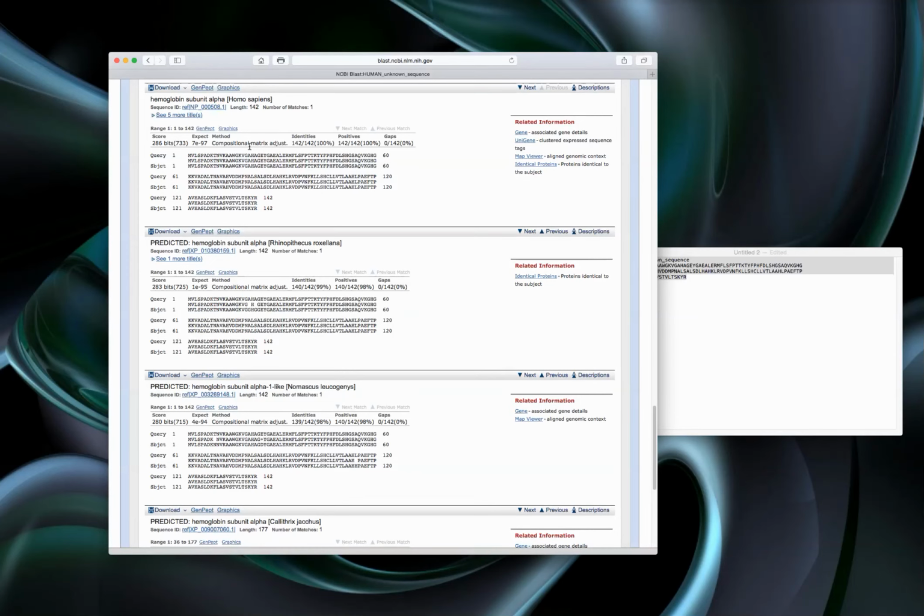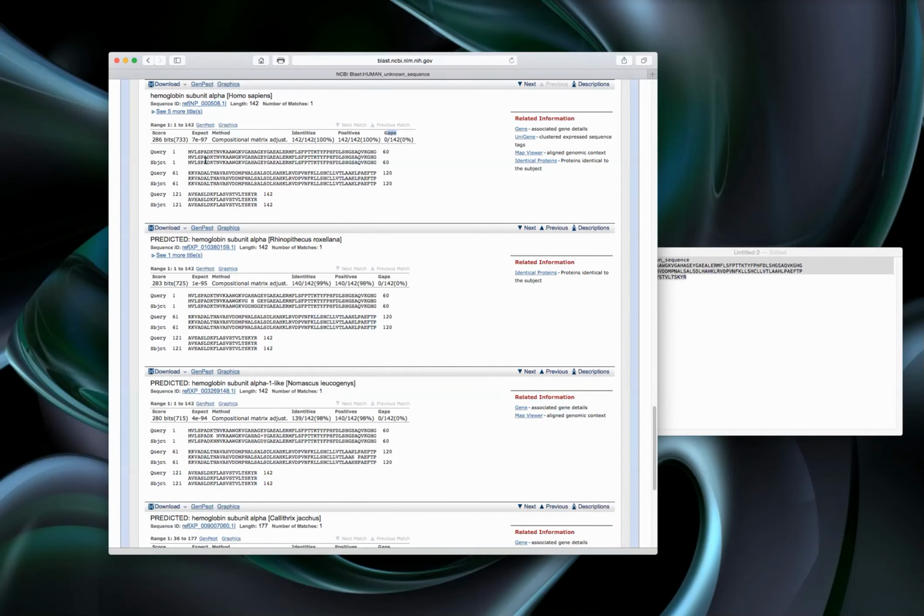Here we have the alignment, the values for identities and similarities between the sequences, the gaps in case they exist, and in the alignment, the middle row indicates the similarity between the two sequences. If they are identical, there is a letter that corresponds to the match character.